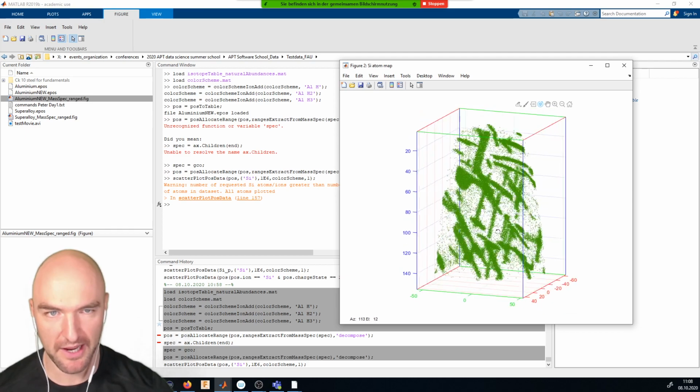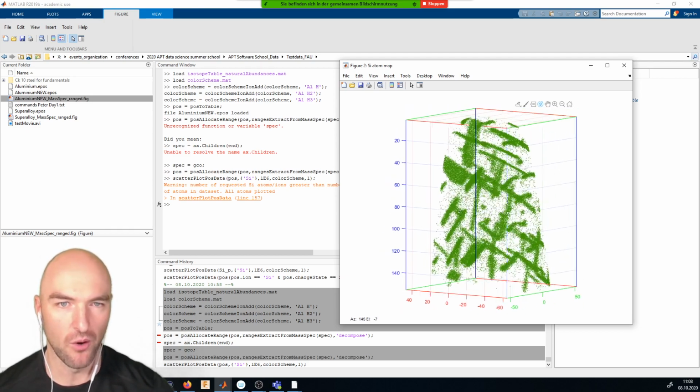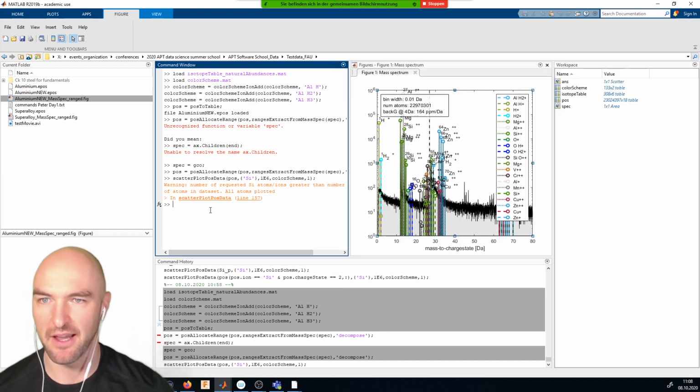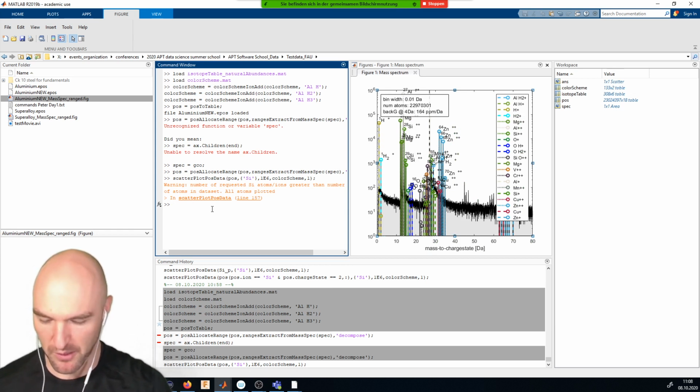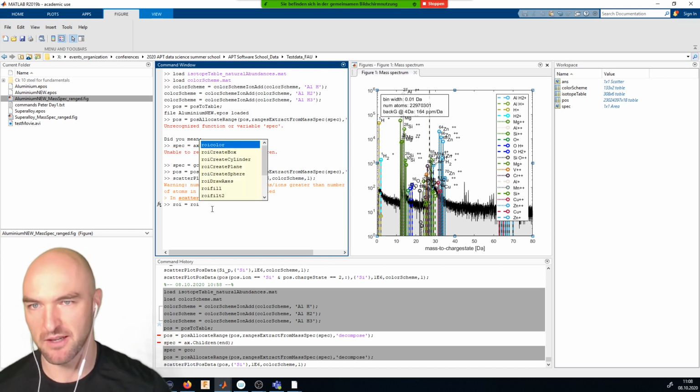Anyway, what we want is some region of interest in there where we can pick one of those needles. And what we can do in this case is create a region of interest object, which I will just call ROI. Obviously, you can call it Dave if you want. You can call it whatever you want. All of our region of interest things start with ROI.